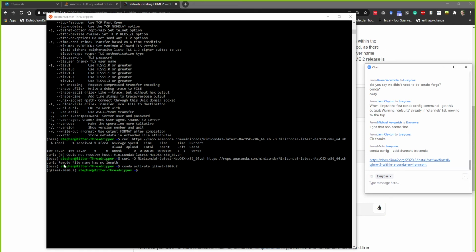So Batya, like I was saying, if you're in the Conda environment, this is going to say the QIIME2 environment in Conda. You're going to see this instead of base. Okay, I gotcha. Thank you. And so you want to get out of that back to base.